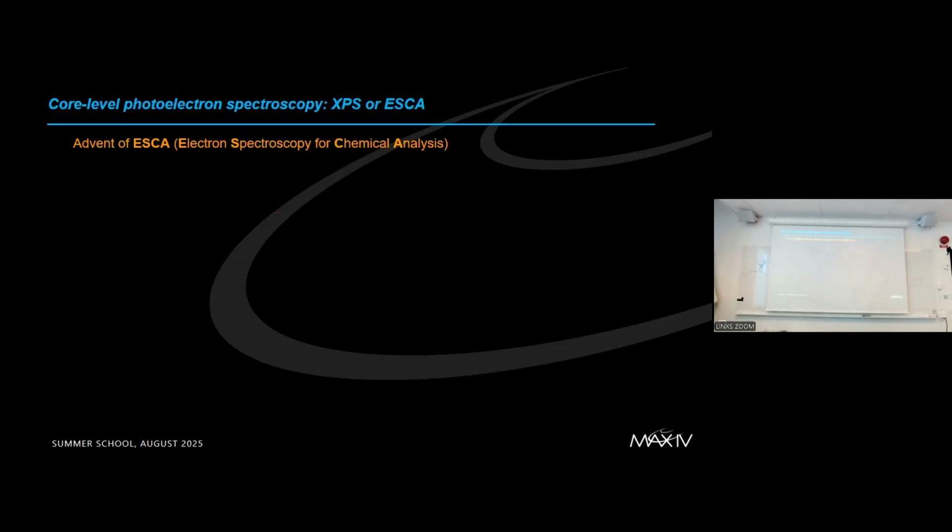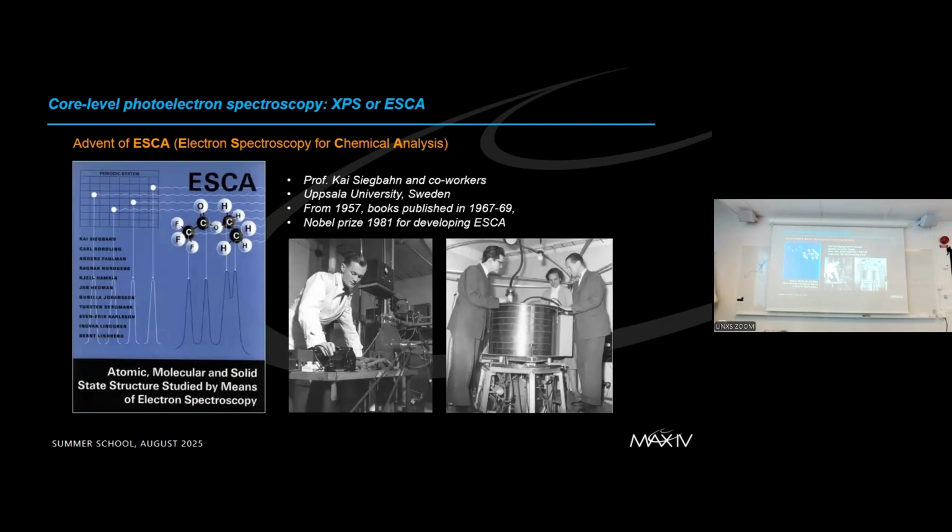Now, this technique appeared some 80 years ago, maybe 70 years ago, and it was discovered here in Sweden, in Uppsala University, in the group of Professor Kai Siegbahn.